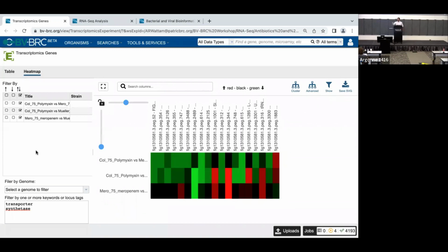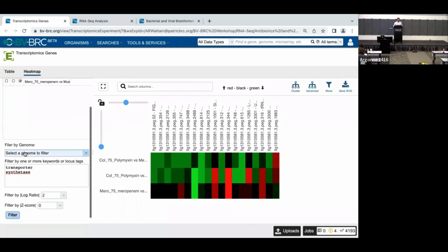So we have a question. I'm using the same parameters that you're using, but I see a difference in my map, slightly in the clustering. Am I not doing it right? Can you scroll down on the log ratio side? I think it's about the same. It's almost the same, right? But I see the difference. It's probably the contrast. I think some of those green values are just above 1, so it looks like dark green. Here, it looks very close to black. I think it's just the gamma radiation coming out of your monitor or something.